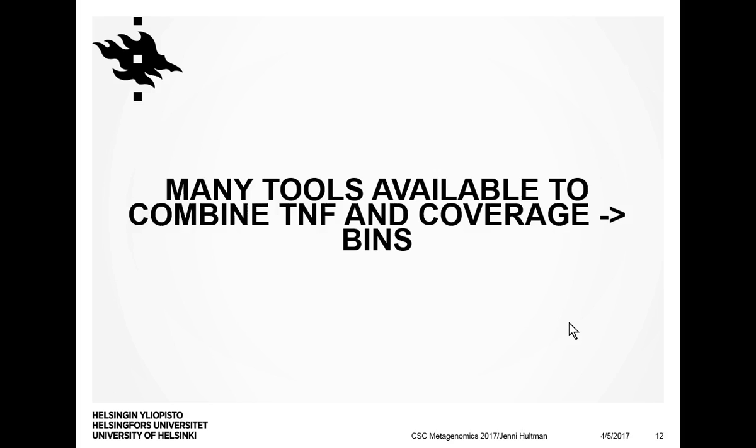As for different parts in metagenomics, like assembly, quality filtering and annotation, there are several tools available, and there is not one best tool. But I will show you a few of those tools that you can try with your metagenomes if you feel like it. And these all combine the tetranucleotide frequency and the coverage to get the bins or the draft genomes.